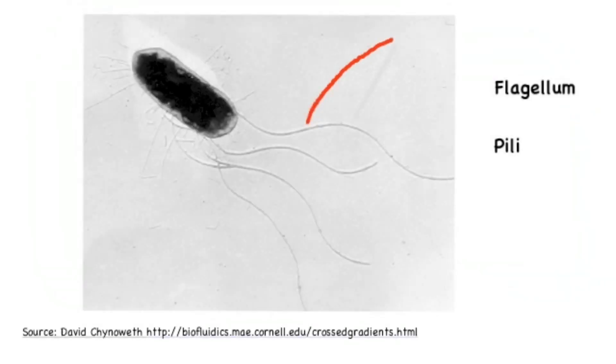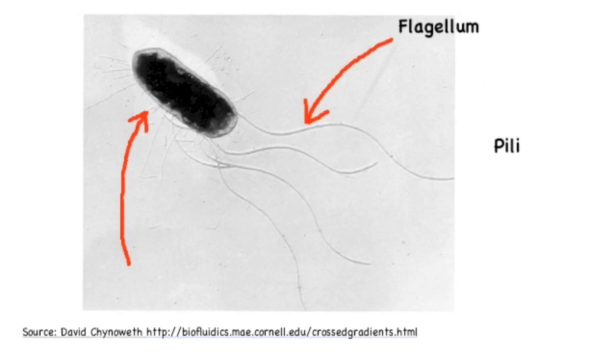Now on this image we can clearly see the pili and the flagellum. The flagellum is the longer whip-like appendages that you see coming out of the end, while the pili are the shorter hair-like appendages you see around the sides.